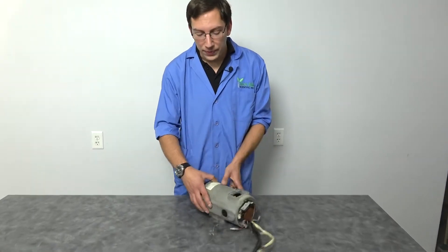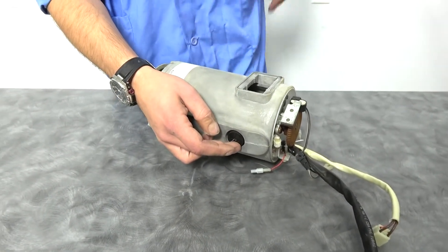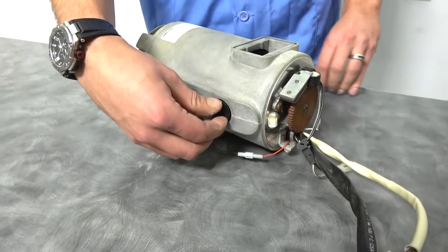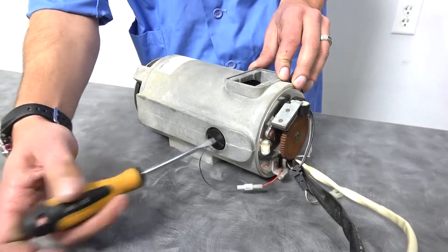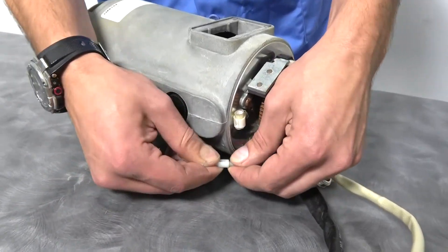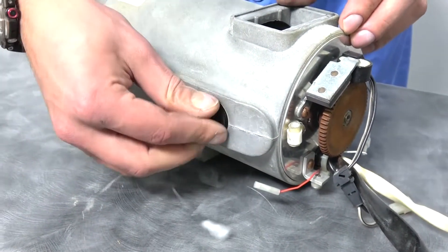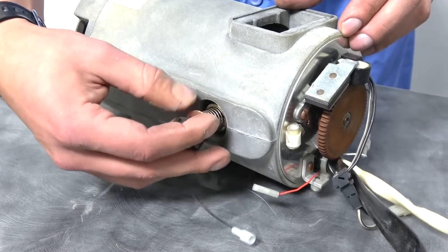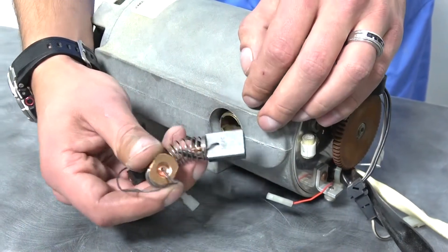The only thing you need to worry about is finding where your brushes come in at. So we have this cap here. Sometimes they're hand tight and you can get them free like this one is. Sometimes you need to use a screwdriver right inside the slot. Since it's already loose, I don't have to worry about that. I'm going to undo this connector, which is just a matter of wiggling it about. Loosen it out, and out comes the spring with the wire attached all the way through it to the brush itself.